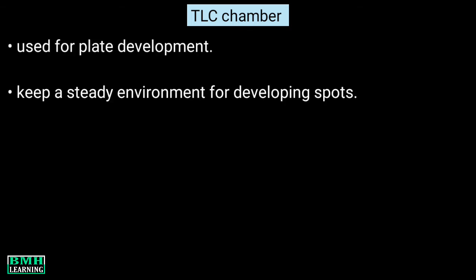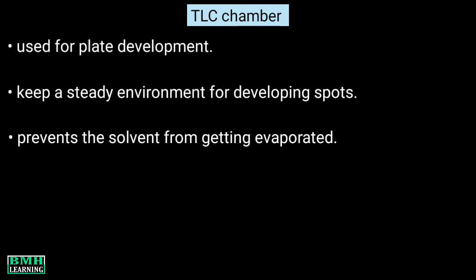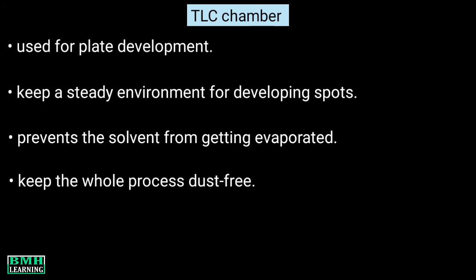Second component is the TLC chamber. The TLC procedure requires a chamber in which the whole procedure would be carried out. Its function is to keep a steady environment that helps in developing spots. Other than this, it also prevents the solvent from evaporating. Plus, it also keeps the whole process dust-free.